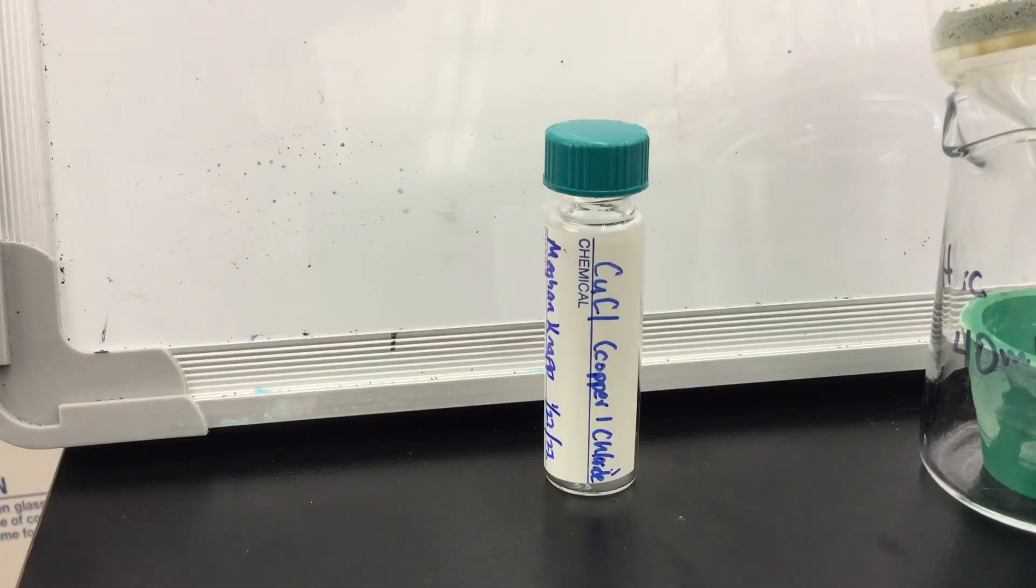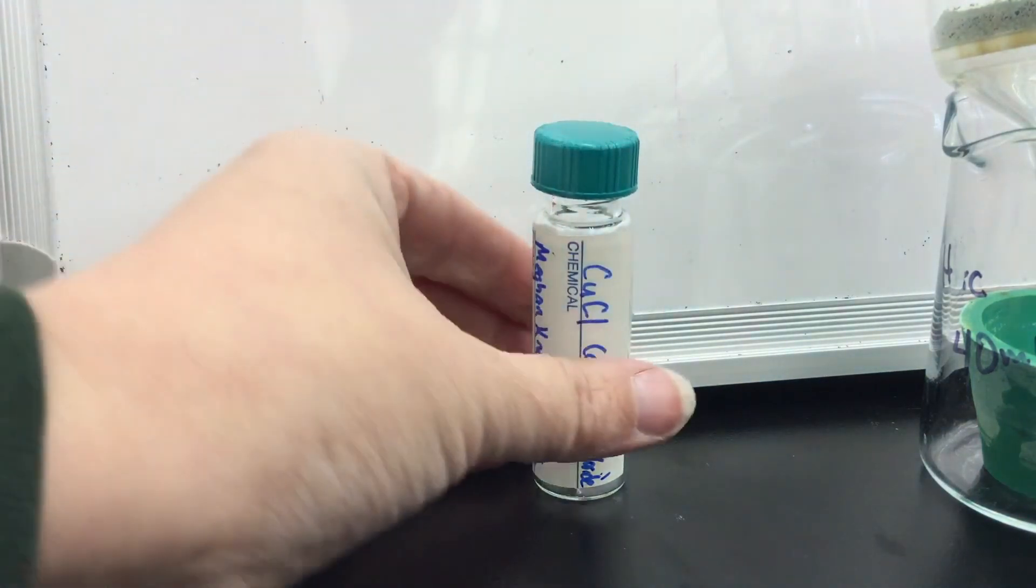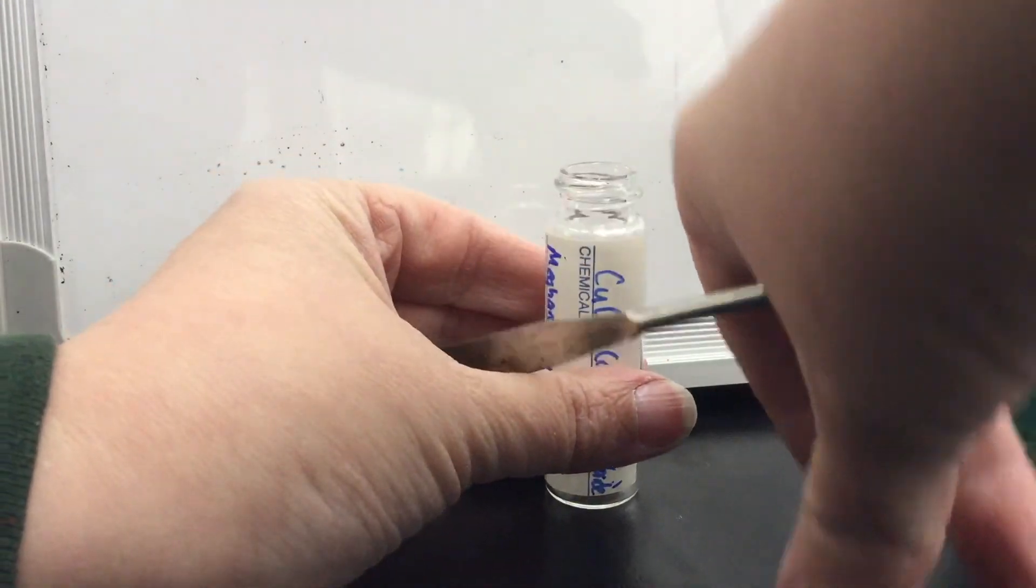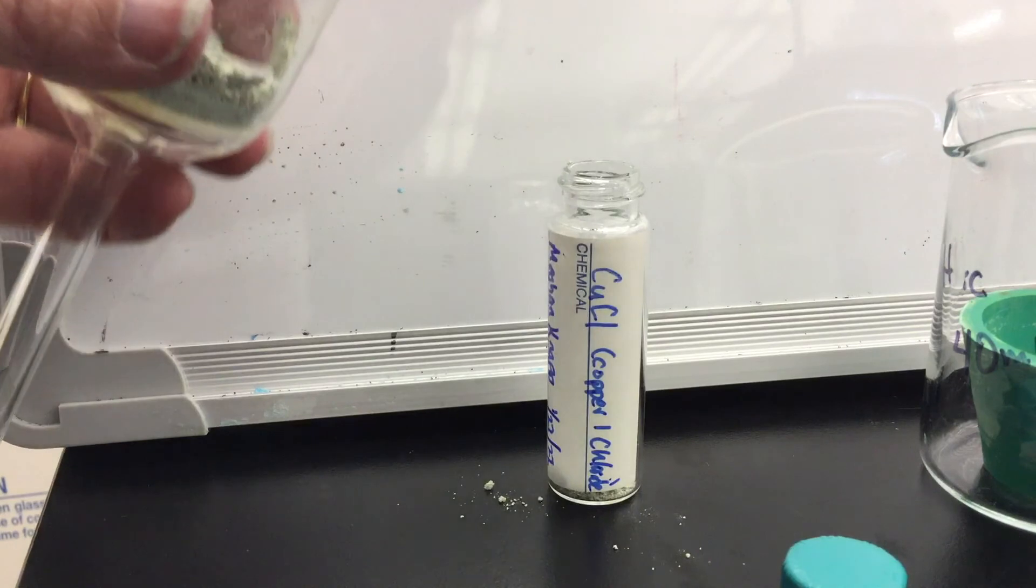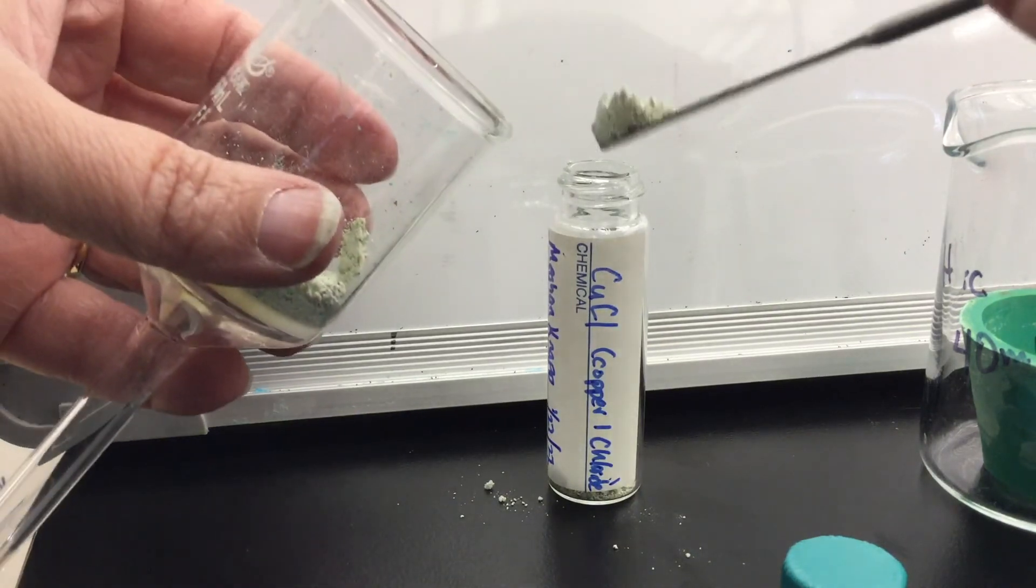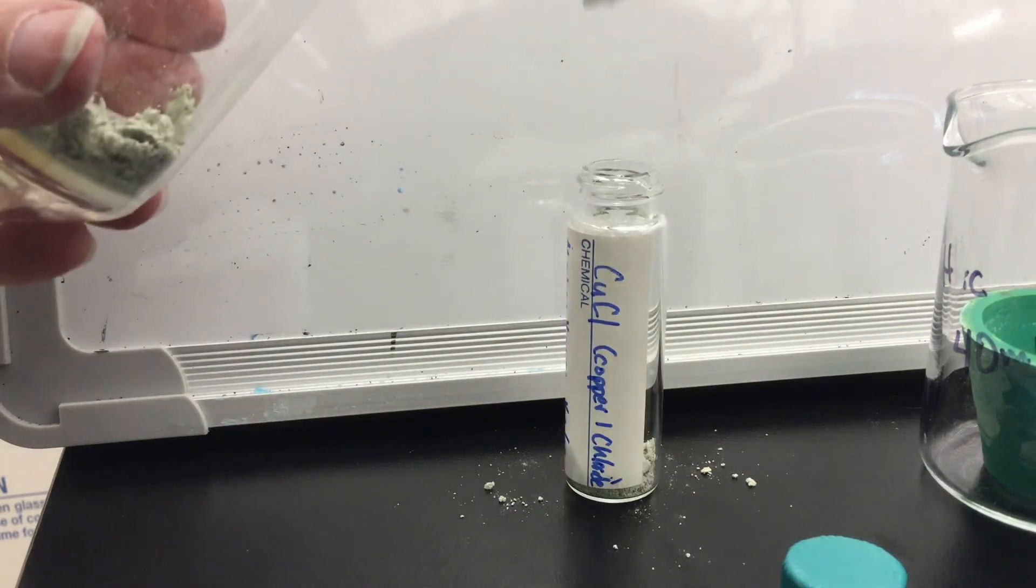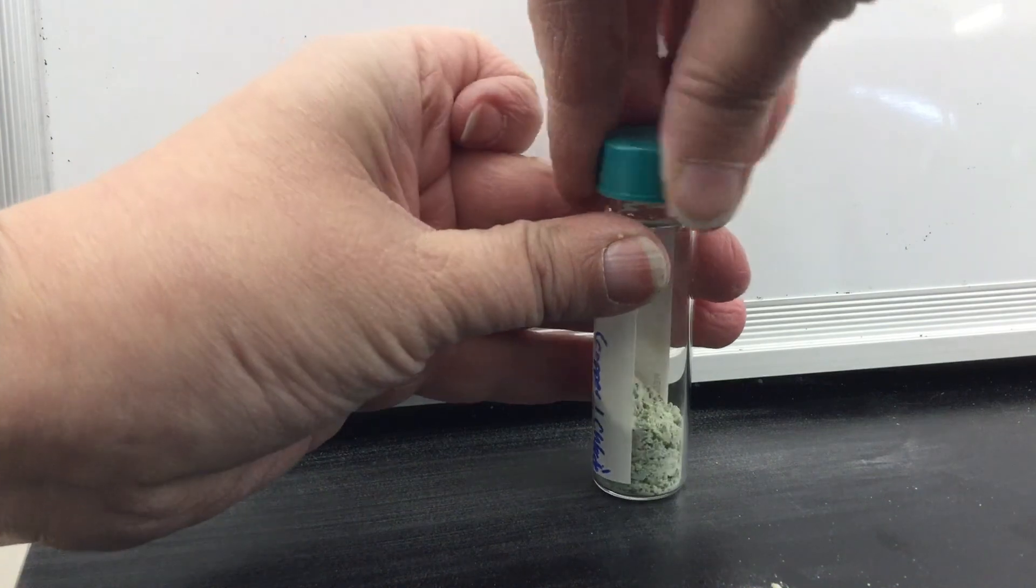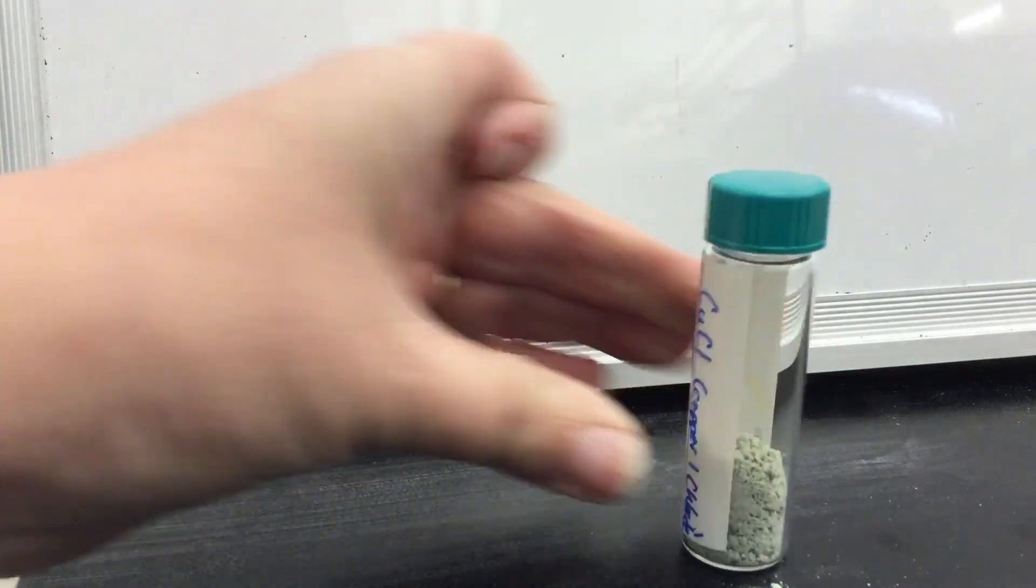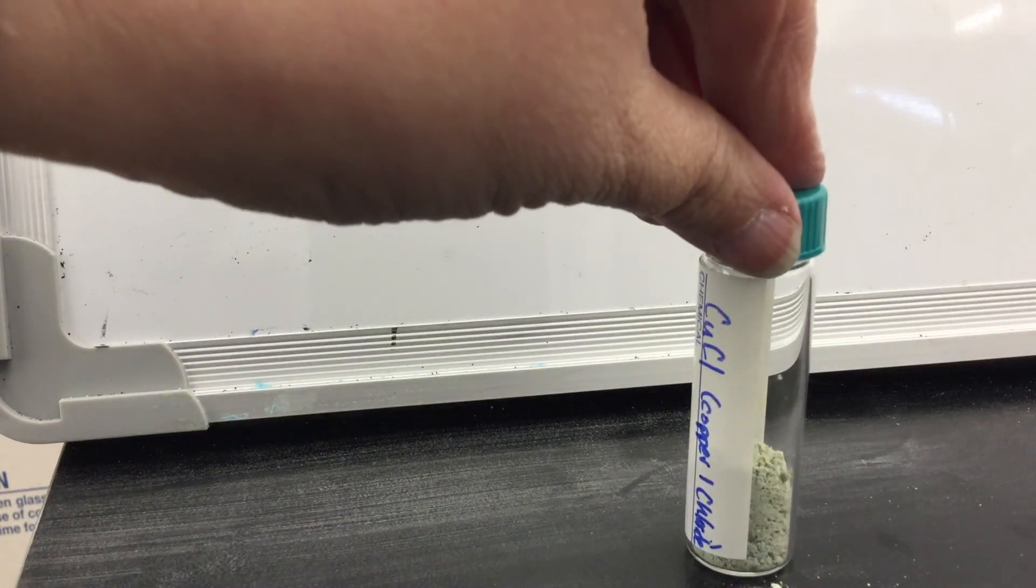Label a vial with the name of the chemical, your name and the date. Weigh the vial with the lid on. If nitrogen is available, make sure that you have nitrogen in the glass tube and then transfer your product to the vial. The product should be fairly dry at this point. Once you have finished transferring, recap the bottle quickly. Reweigh the bottle and determine the percent yield.